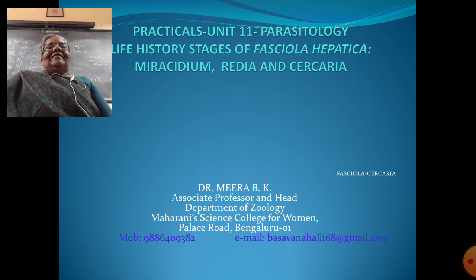You have studied this in theory also, I suppose. In this practical class, you have to learn about 3 larval stages that you come across while studying the life history of Fasciola hepatica, commonly called liver fluke.